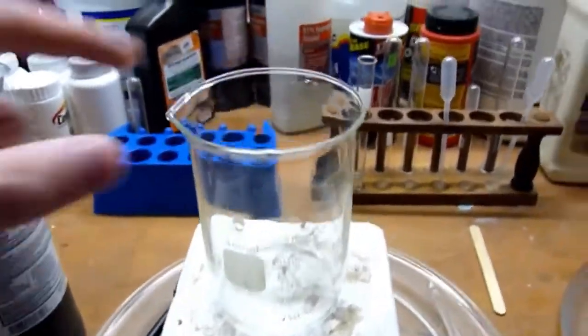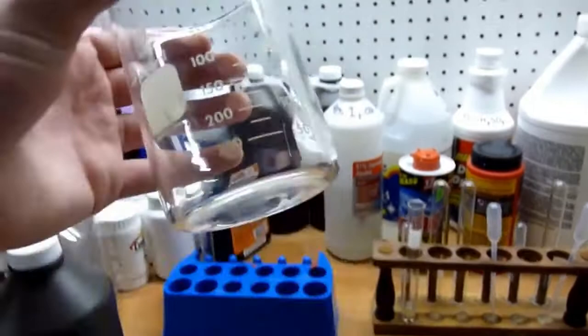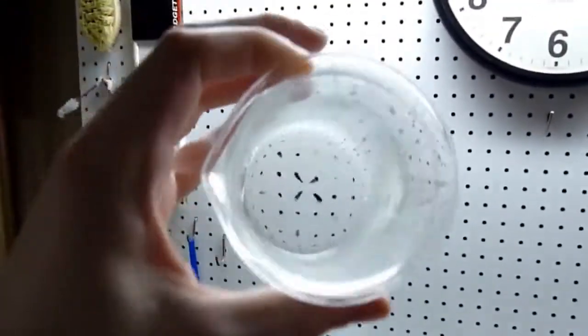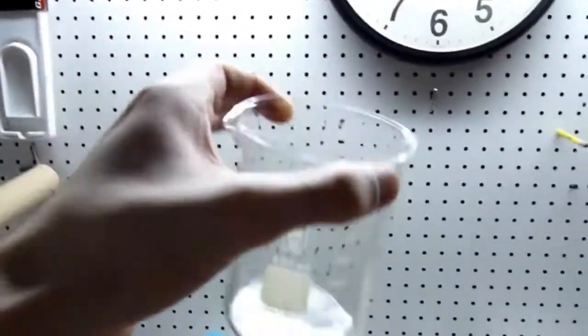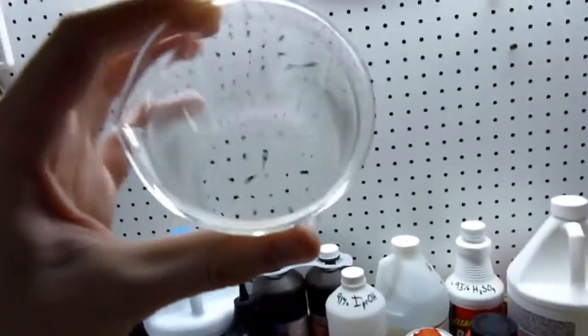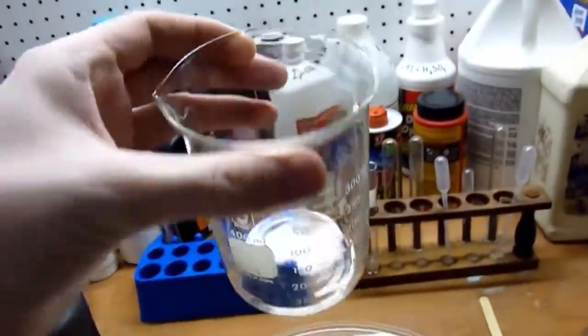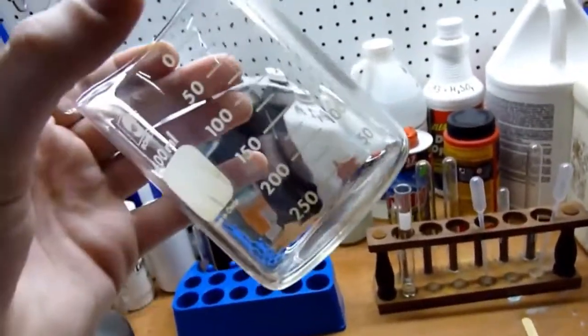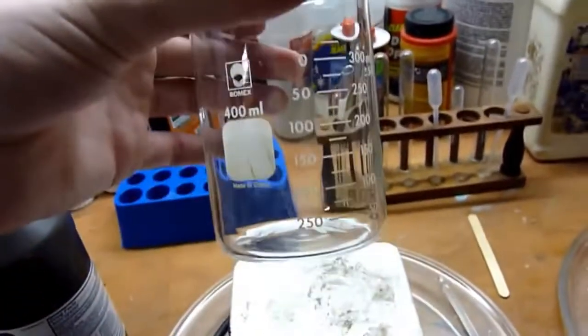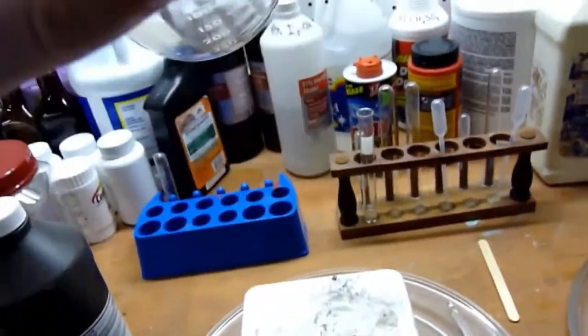The name of the game here is you want an extremely clean beaker. As you can see, I just washed this out. There's a little water in the bottom. But you want it as clean and scratch-free as possible, because every little scratch, every little piece of dirt in there tends to decompose the hydrogen peroxide. So you want it dust-free, absolutely clean.